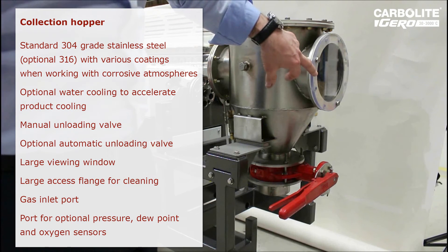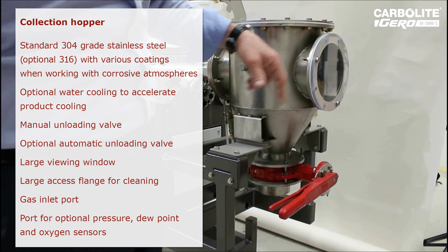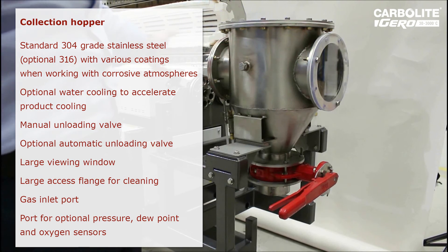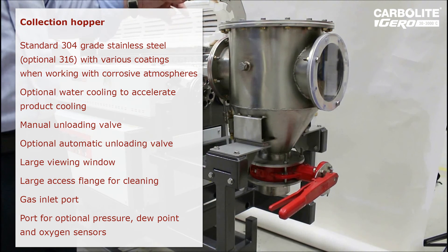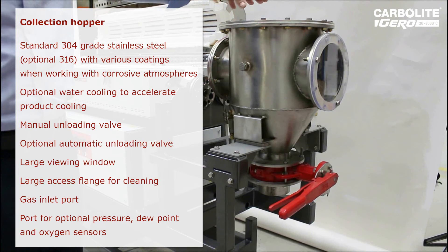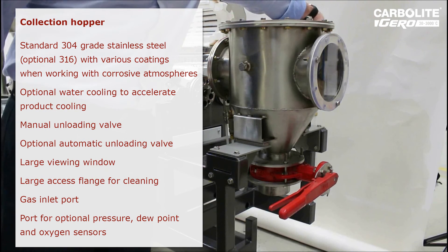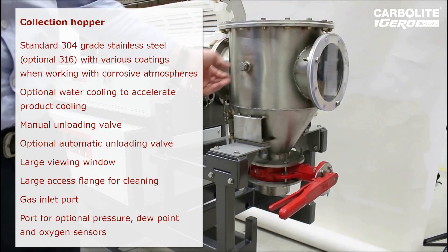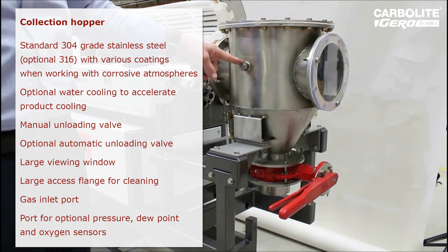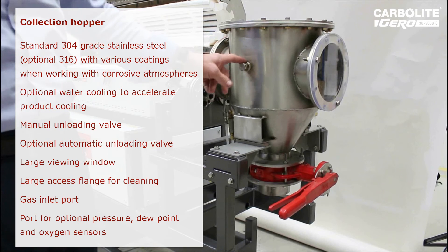A view plate enables the operator to look down the work tube and see the product being heated as it passes through the various heated zones. The collection hopper has large access flanges for ease of cleaning, with inlet gas ports on the side and ports for sensors such as oxygen analyzers or dew point meters.